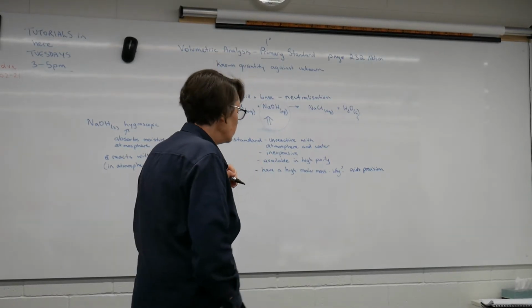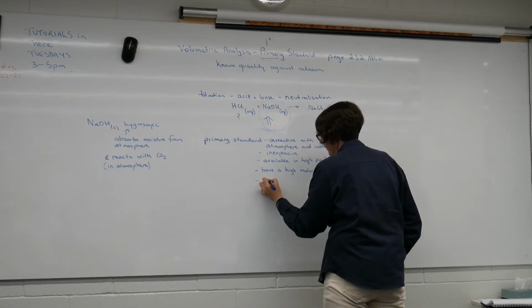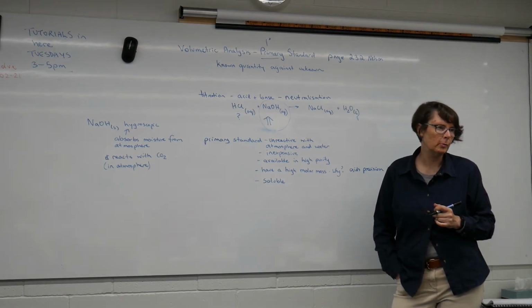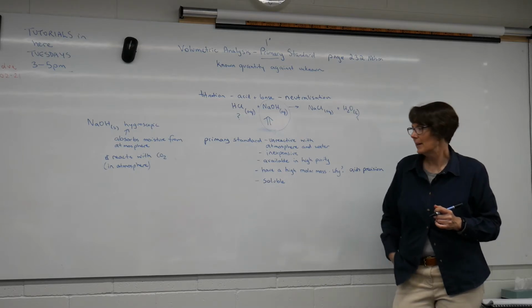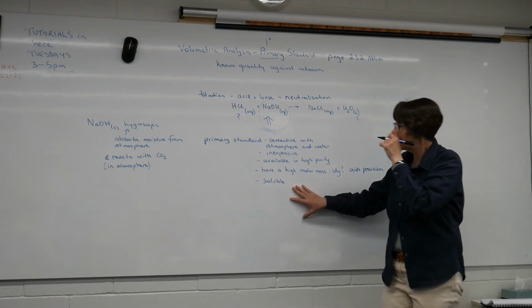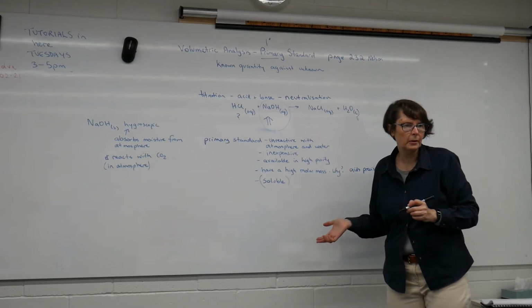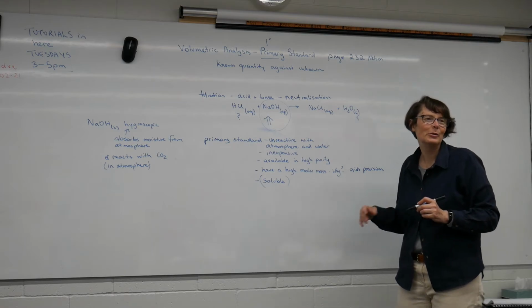We also want it to be soluble, but really I think that's a given, don't you think? Why would you be choosing a compound that's insoluble as your primary standard? This one doesn't really give me much information about your understanding of primary standard. So even though it's true, I wouldn't pay you very many marks if that was your answer.